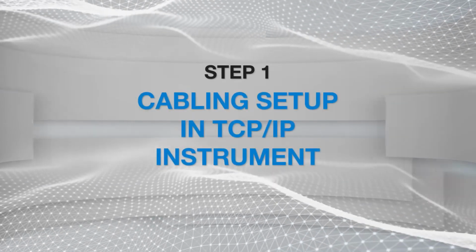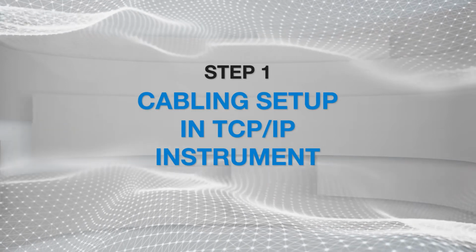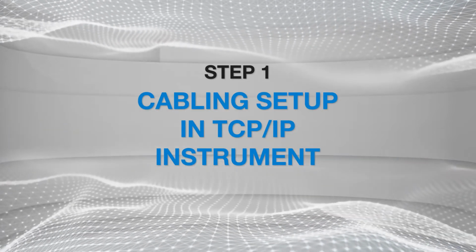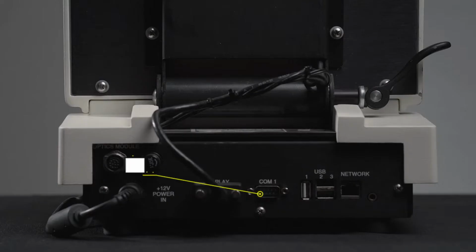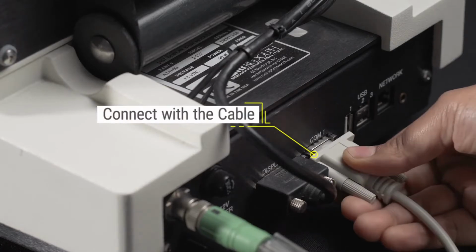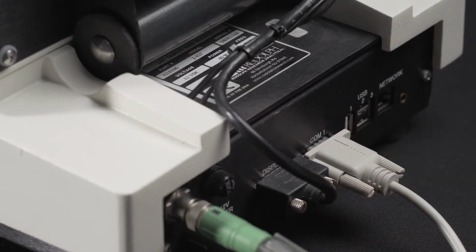In this section of the video, we will cover the connectivity of RS-232 devices to the SDMS application. First of all, try to find out what type of pin structure you have on the instrument device. Select the appropriate pin structure and connect the cable.